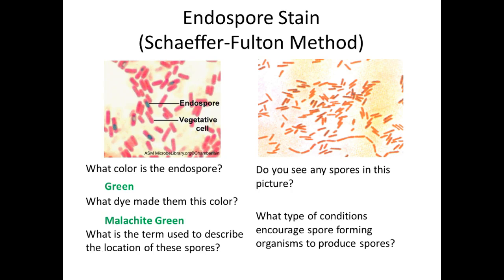On today's quiz too, depending on if you were able to catch one like they did here, do you see how the spore is still inside the mother cell? Where would that location be, terminology-wise? Subterminal. Good job, y'all. So it's not smack in the middle, right? And it's not all the way at the end. Smack in the middle would be central. All the way at the end, terminal. So this one's in between central and terminal, so it's subterminal.